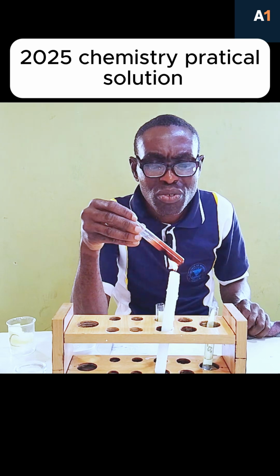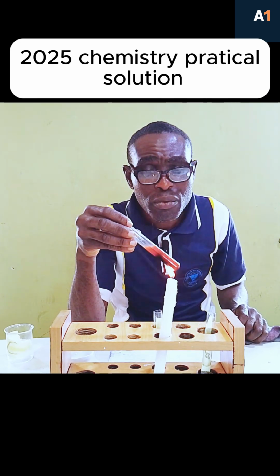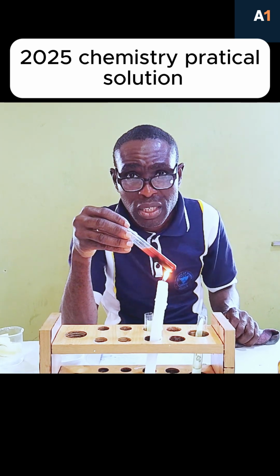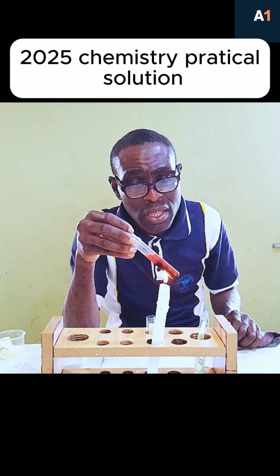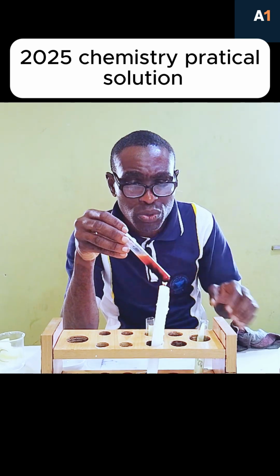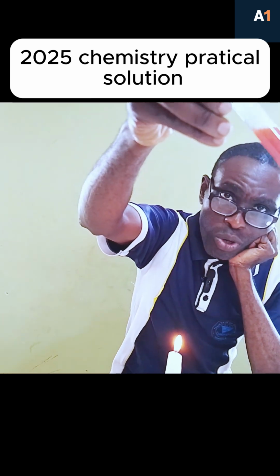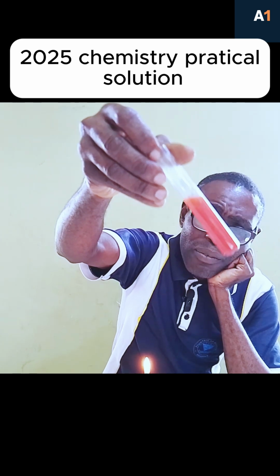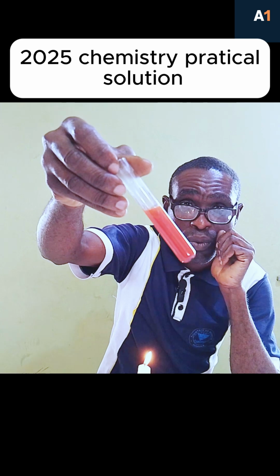Let me tell you, don't let anyone, be it the school or anyone, render you useless. That is what they are doing in hospital. Testing anything, the reagent that reacts with that thing will give you a result. So you can see, from blue to brick red, which you can record. Whatever you see, just record it. So now this is the result of this.